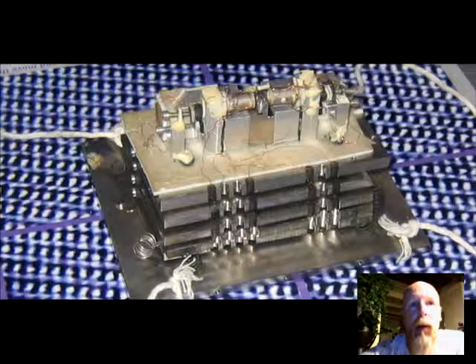That probe swinging across the atoms is what gives you an image, whereas the cantilever is based on deflection and so on, and the different modes in which it can scan. In 1986, actually, Binnig and Rohrer won a Nobel Prize in physics for the STM, and the STM and the AFM are now the foundations on which a wide range of scanning probe microscopy techniques are built.